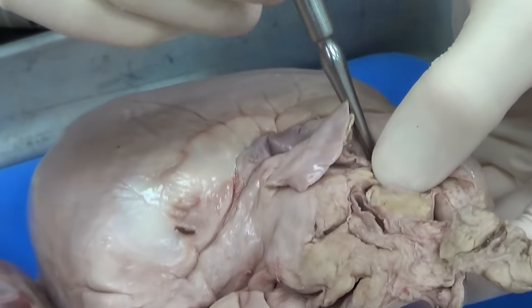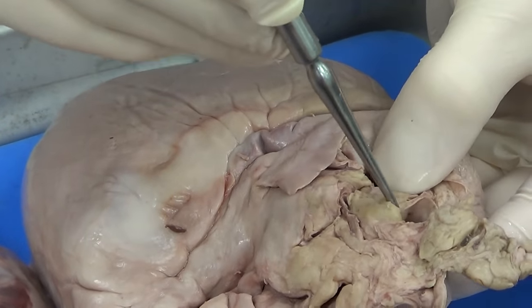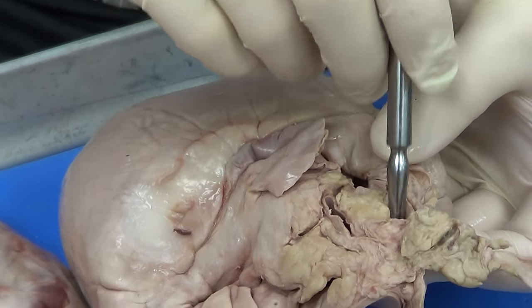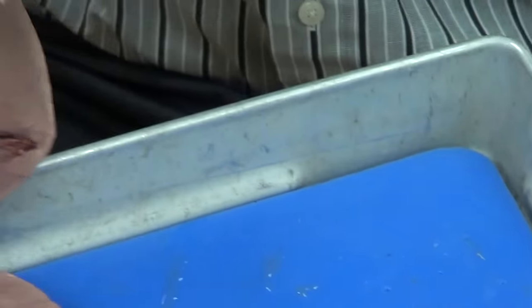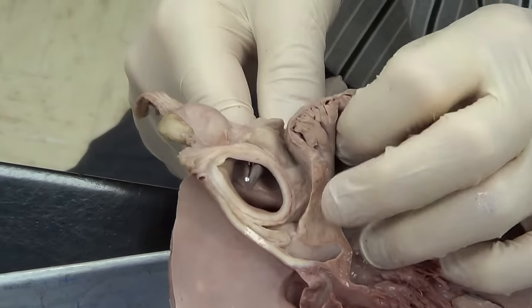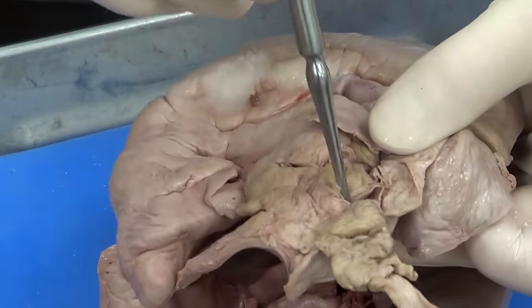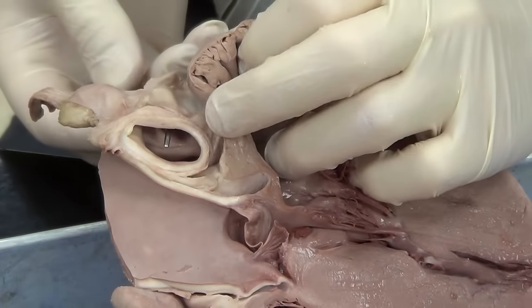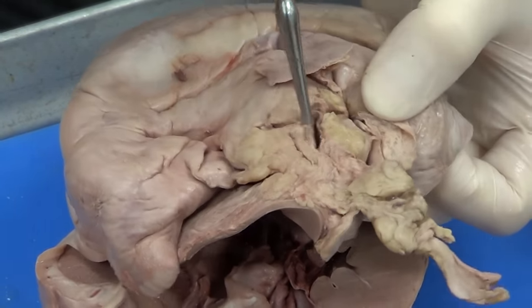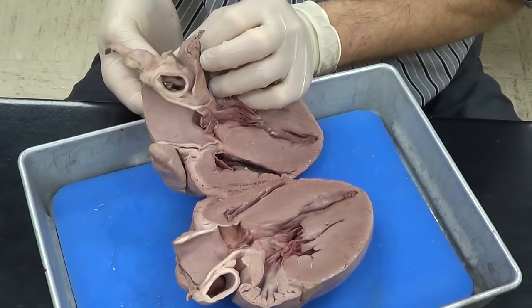Now above it, I have two more blood vessels. They look like veins, but I'm not positive. I'm going to put my probe through that hole. Notice it comes out into this rather large, thick-walled artery. So what this is, is a branch of the pulmonary artery. These here are branches of the pulmonary artery.